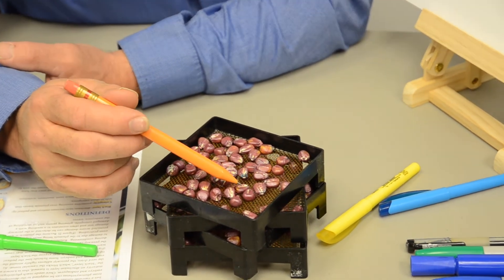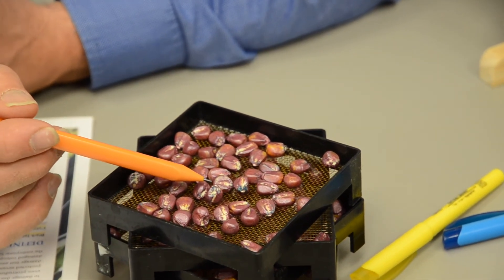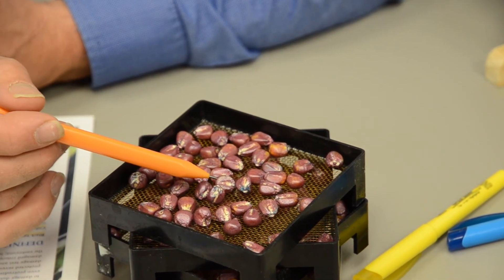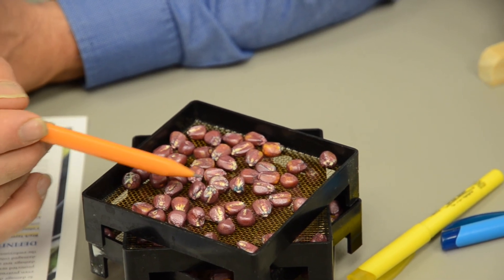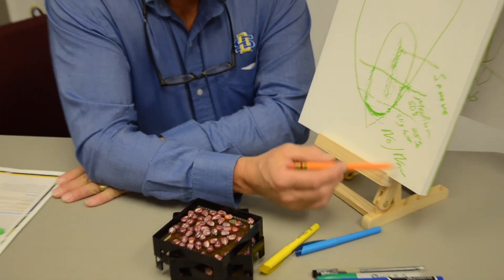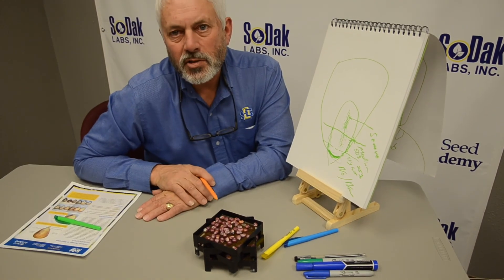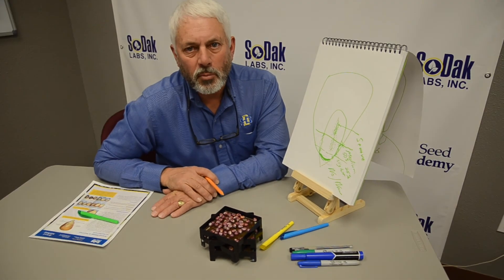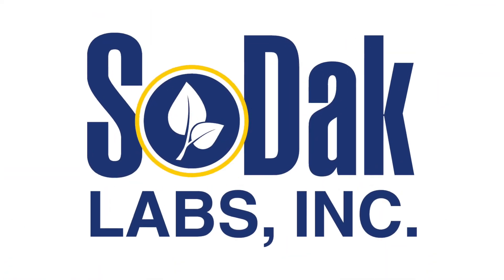There's a number of kernels here that show no damage, and then we'll see a few that might have just a slight bit of damage near that pedestal tip. That's slight damage. We put out a rating, the percent of no damage, slight, medium, and severe. And that's basically how we do the pericarp damage test on corn.